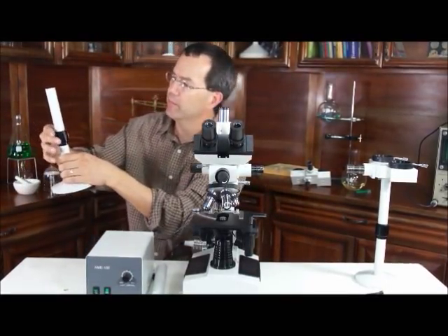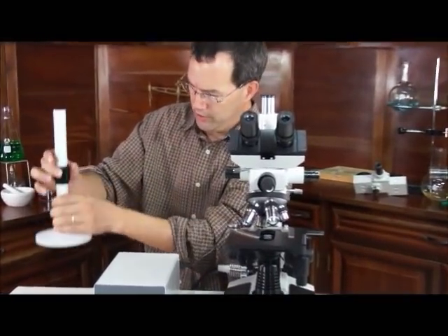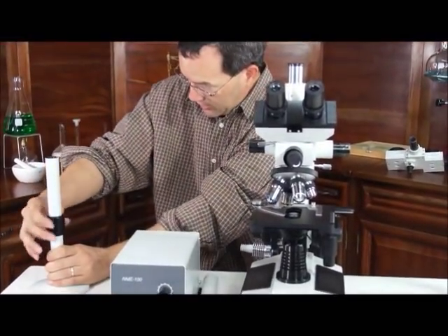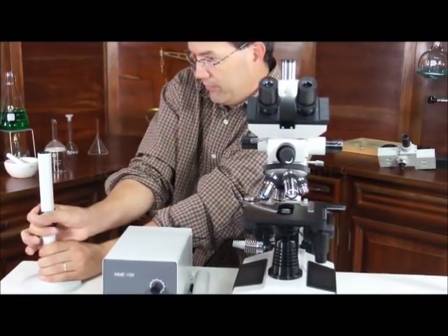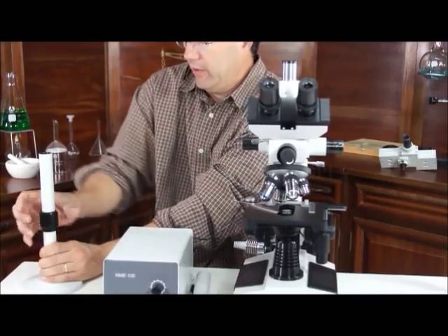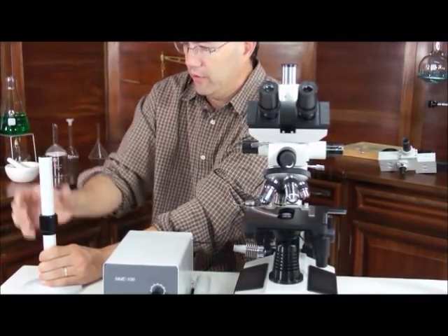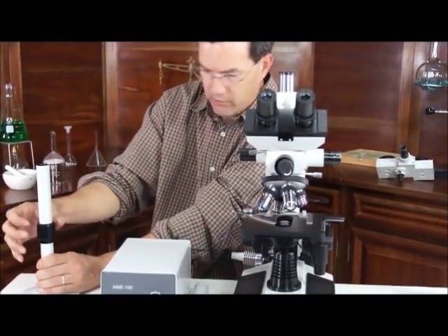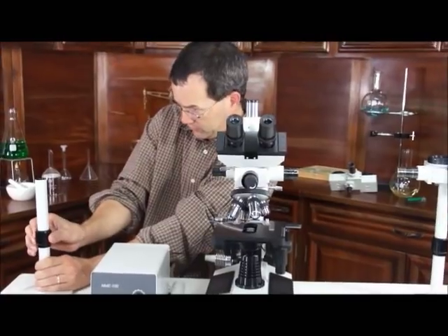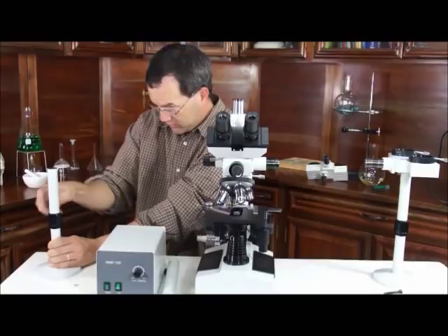These stands have a feature where you can turn them. I can turn it this direction and it lowers it; I can turn it this direction and it raises it. It's just a small amount of travel, maybe a quarter inch or so — just that many threads, that much distance to raise and lower.